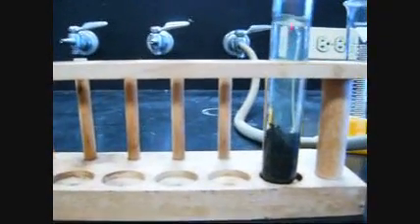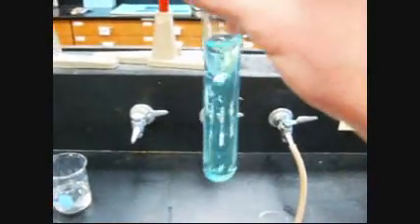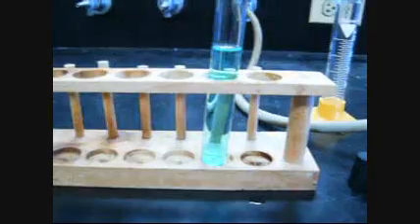Alright, now we need to mix it to get this reaction to happen completely. So I'm going to use a stopper to make it a little faster. See what's happening here. Within just a minute or so, we have once again a nice clear blue solution. Alright, so the black solid is gone after just a few minutes of reaction with the hydrochloric acid.